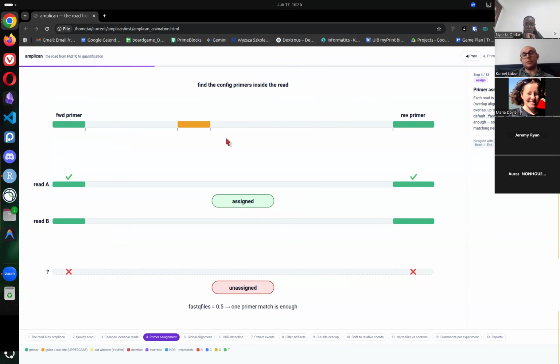So you can also try to align to the genome and then treat your reads that way. But some people make a mistake and put their guide on this side, very close to the primer, and then this sequencing cannot reach well past the guide with the deletion, and the forward primer might also be deleted, and then this whole thing is completely difficult to do anything with.